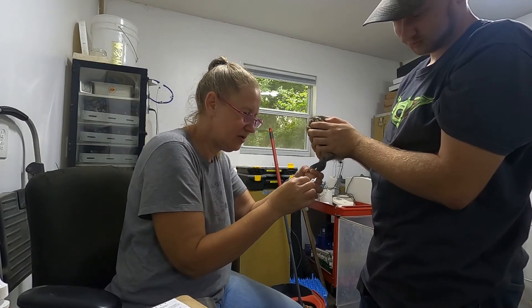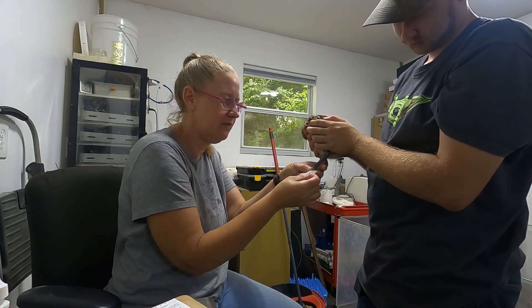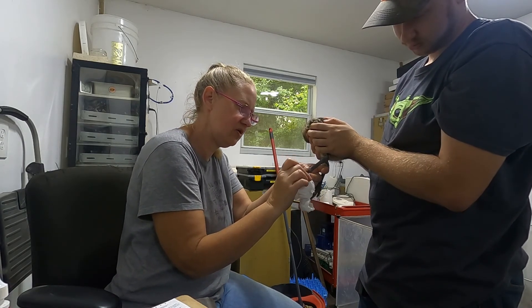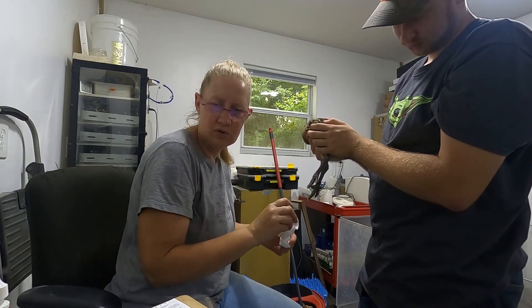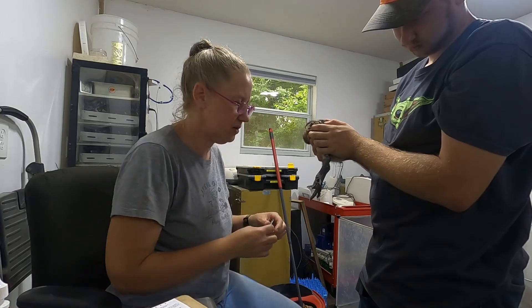Hey! We are DNA-ing a different way today. We have a few samples that didn't come back from the lab as conclusive, so we are taking blood samples by clipping toenails.